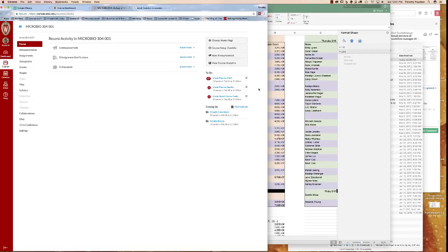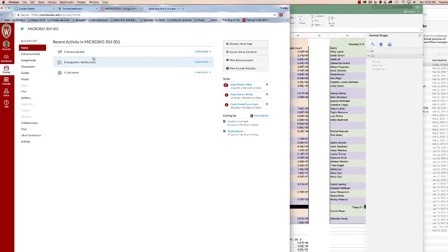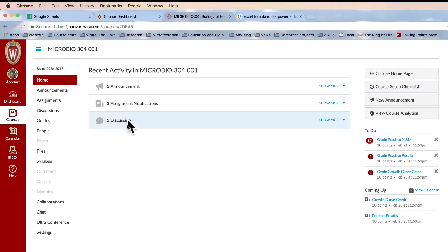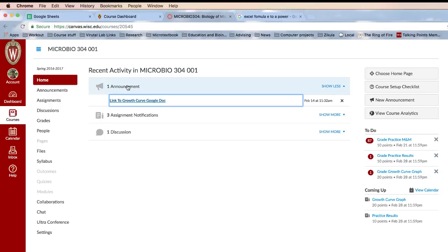This is a quick tutorial on how to graph your growth curve data. First, go to the MicroBio 304 Canvas site. You'll see an announcement there with a link to the growth curve on the Google Doc.